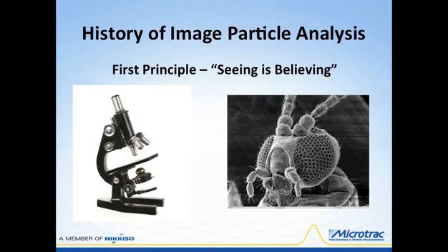Particle morphology characterization has a very long history. The only tool analysts had originally was a manual optical microscope, not even as modern as the one shown above. A small sample of particles was distributed as evenly as possible on a glass slide. The slide had square grid marks etched on it, and the sizes of the particles were estimated by comparing their length and width dimensions to the grid lines. Ratios of different sizes were calculated to gain some basic shape information, like dividing length by width to get aspect ratio.